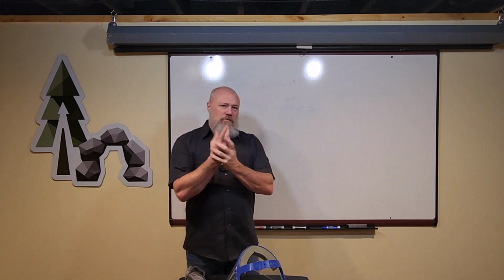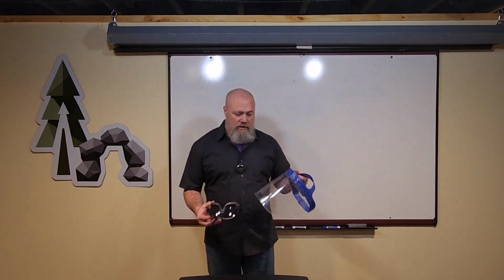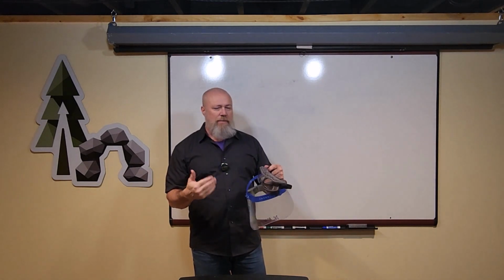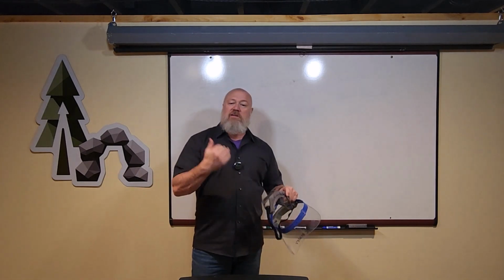Required to wear a lab coat and closed-toed shoes in my lab. You'll also be using gloves constantly. It's not strictly necessary. You can always wash your hands, but sometimes it's better and easier just to have the gloves on. We will provide nitrile gloves for latex sensitivities. Beyond that, and these are optional, is the use of goggles in the lab. You can wear these just because sometimes proper dissection, let's be real honest about it, sometimes little pieces fly up a little bit. If you're getting a lot of splashback, maybe you're dissecting at too great a speed and you should slow down. But don't worry, I'll be there to yell at you if you're doing that.